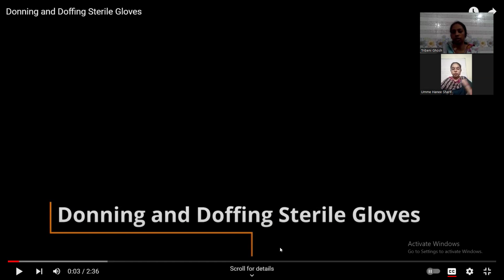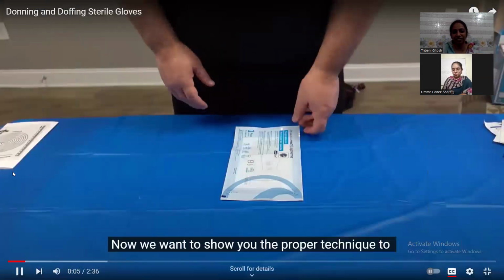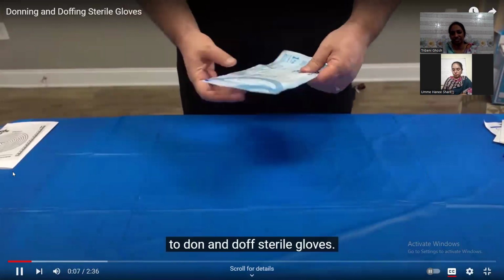Donning means putting on, and doffing means taking off the gloves. You will hear that word several times, so I should tell you in advance. Now I want to show you the proper technique to don and doff sterile gloves.